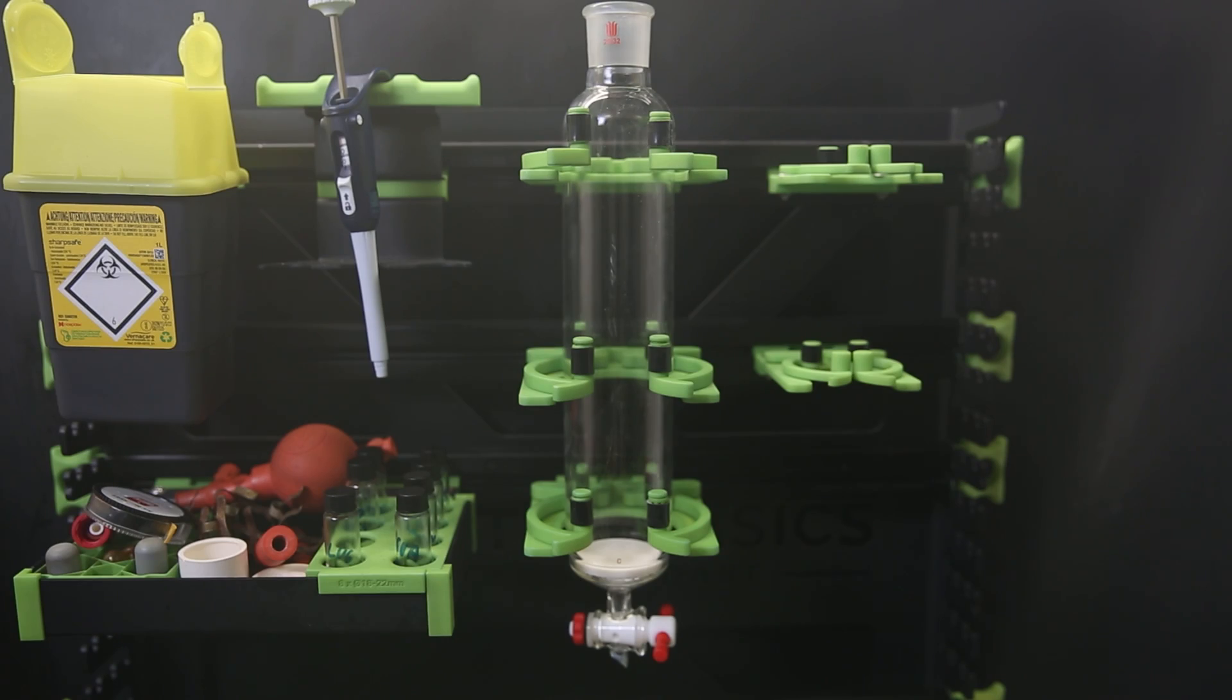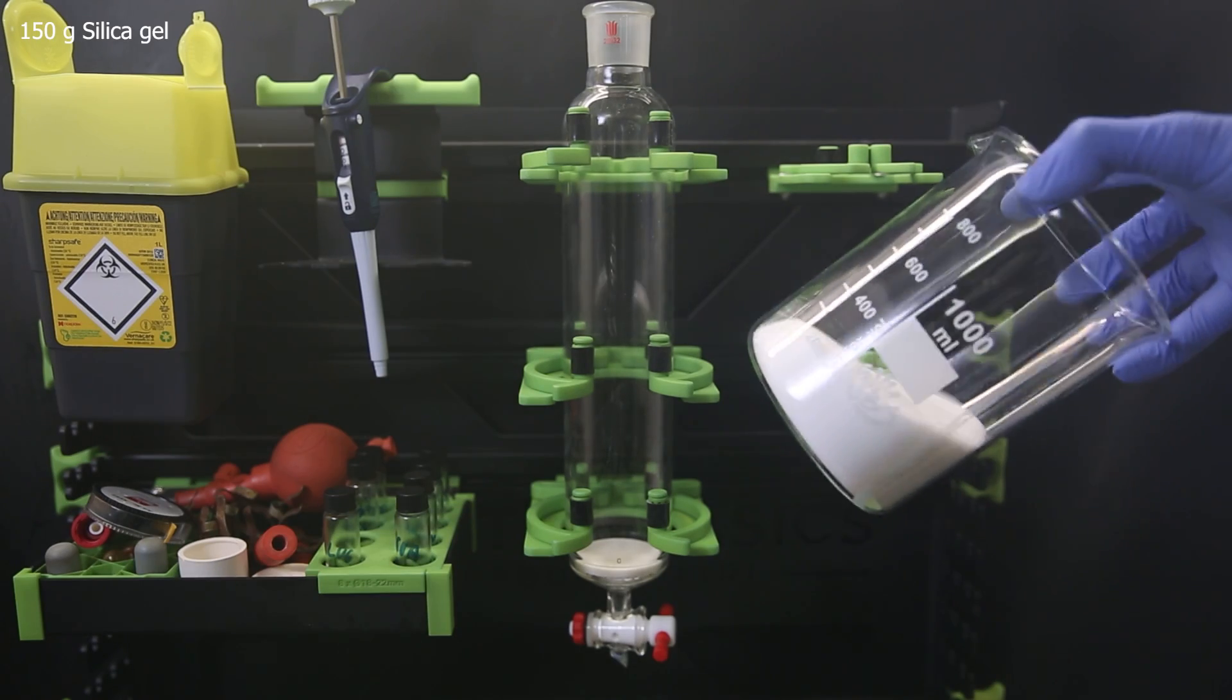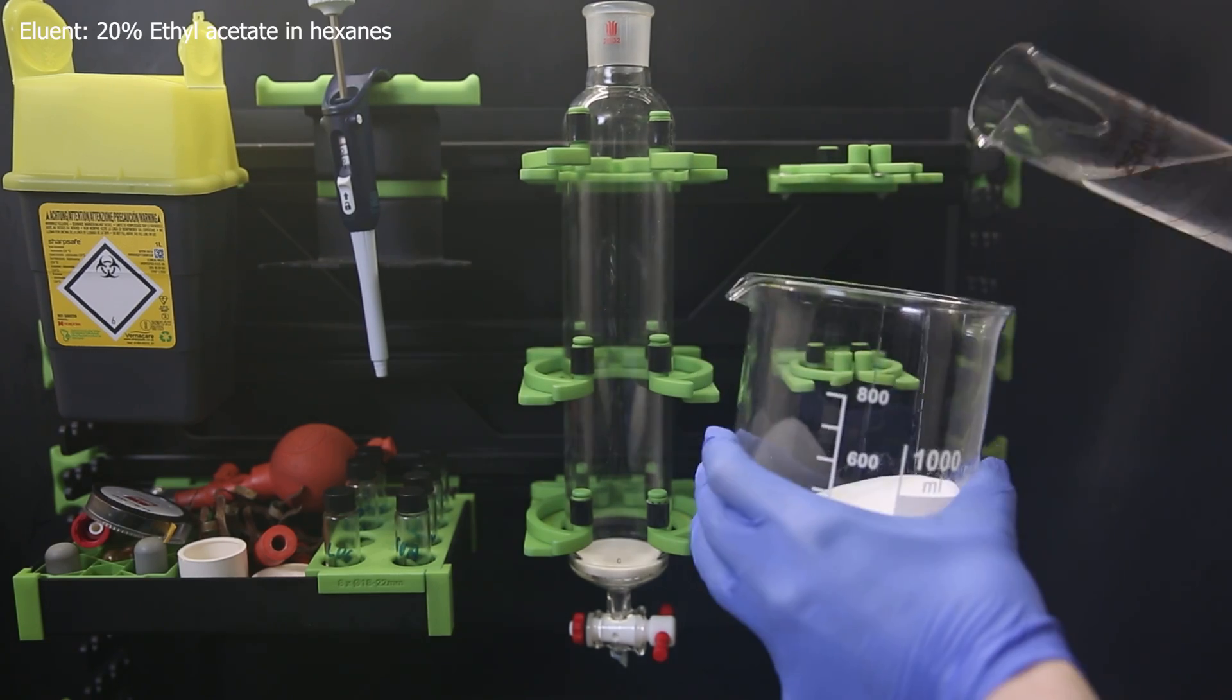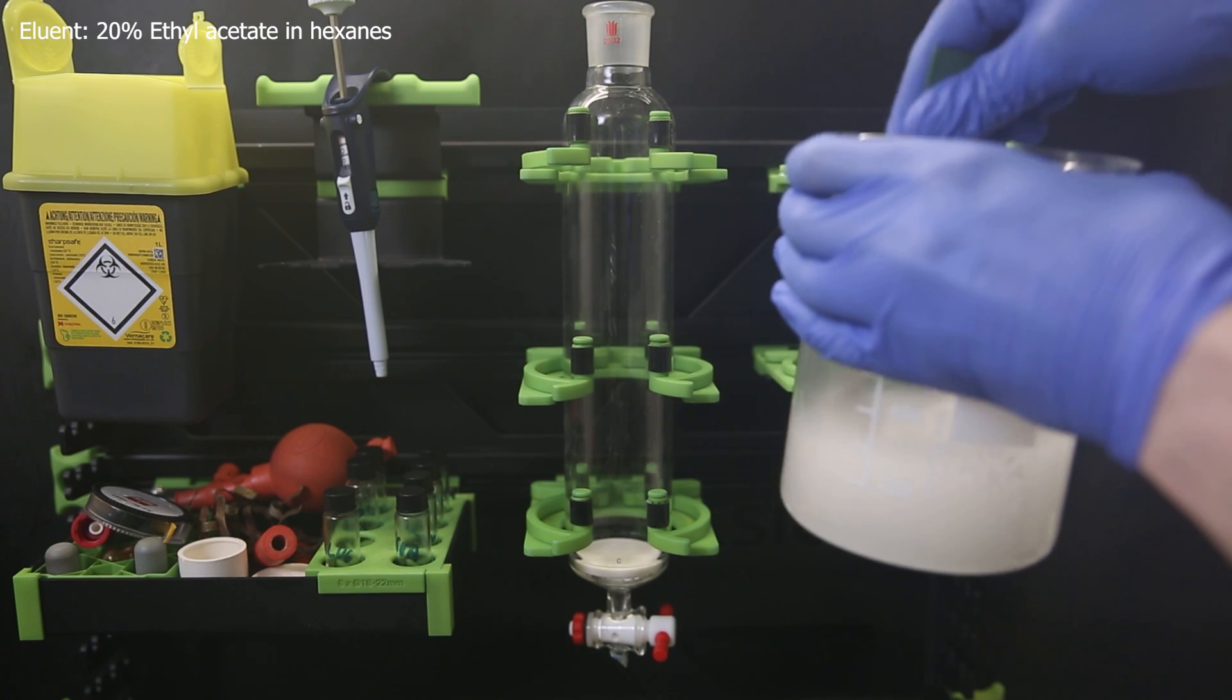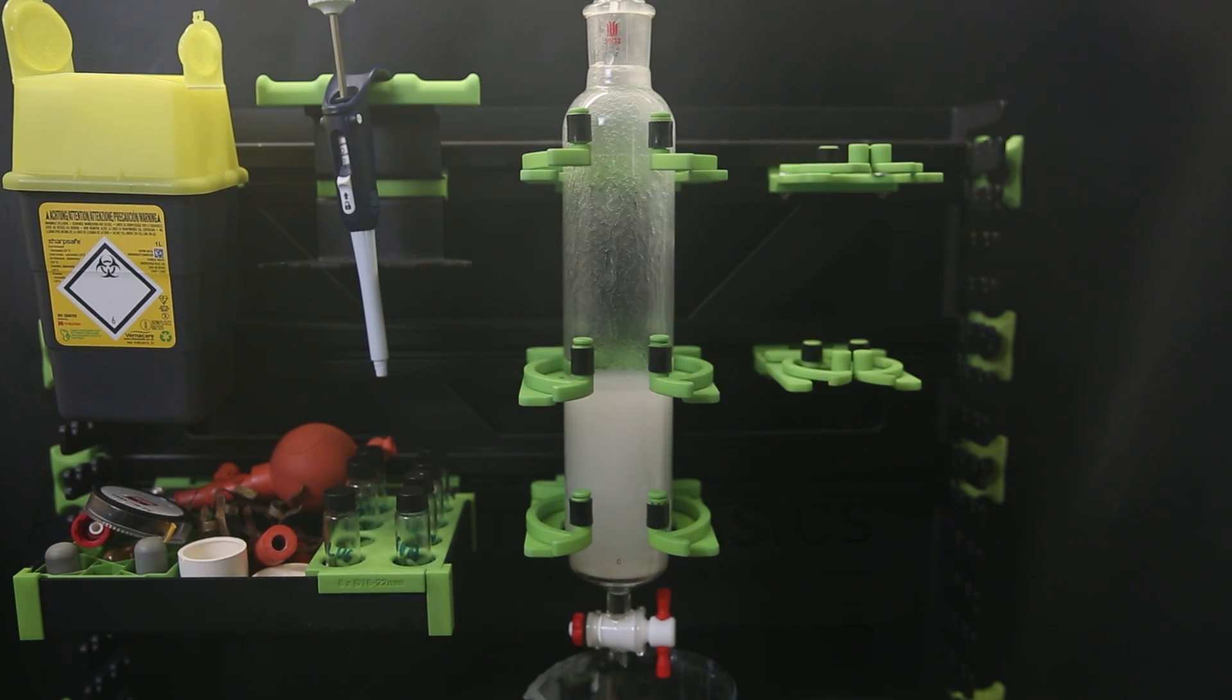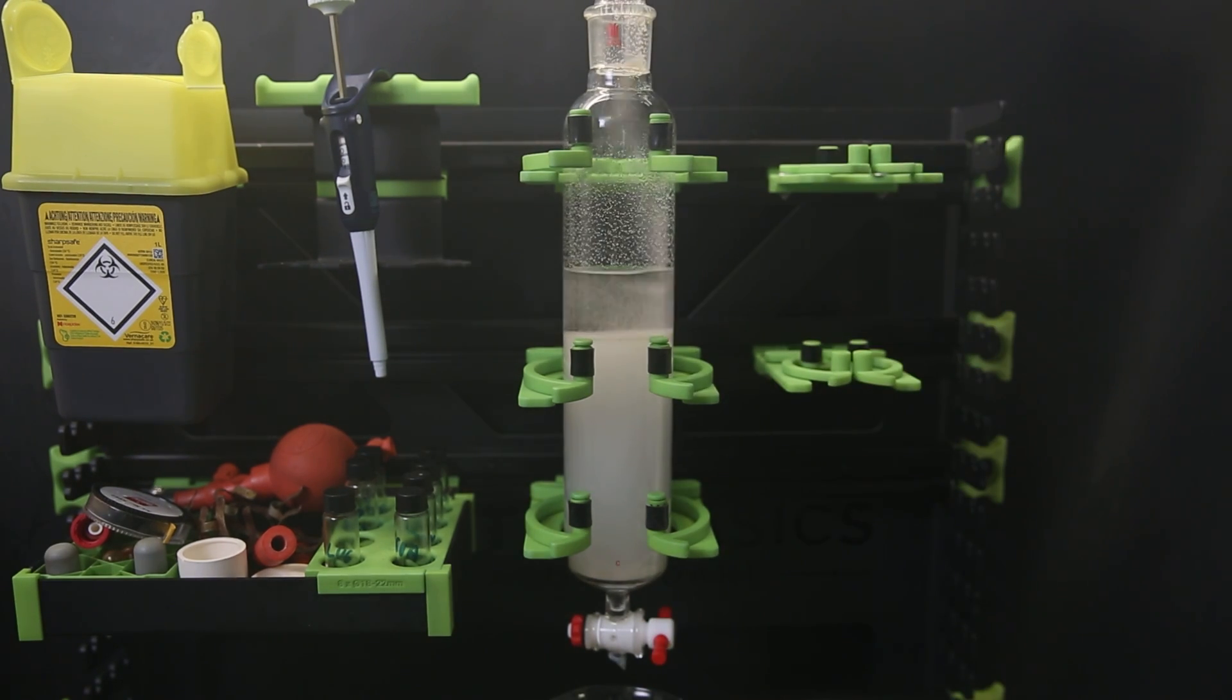So I set up a column and weighed out about 150 grams of silica gel. I mix that thoroughly with the eluent, which is 20% ethyl acetate in hexanes. I then pour it all into the column along with more eluent that I run through several times to pack the silica tightly. When that's done, I put a small layer of sand on top to protect the silica.